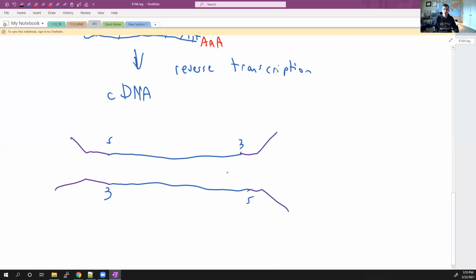These adapters are generic, made by Illumina. They're just going to be ligated to the ends of this DNA molecule. And then, I'm skipping over some magic. Then we put this on an Illumina flow cell, where this single fragment will be amplified hundreds, millions of times. And like any good DNA technology, we have to sequence from 5' to 3'.